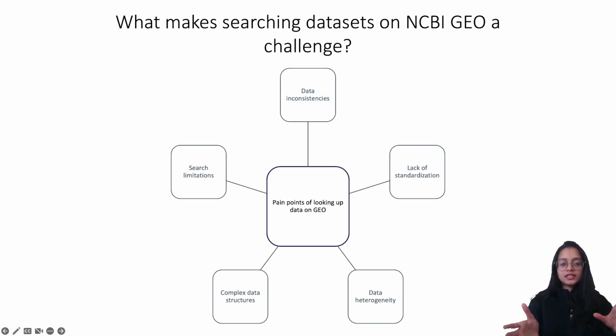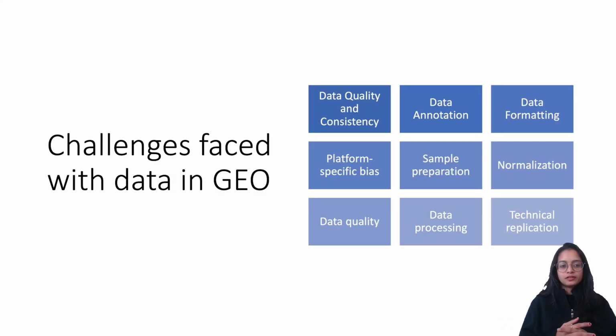In addition to these challenges of looking up datasets on NCBI GEO, there are also challenges associated with the data that are present in GEO. Even if we do manage to find the relevant datasets of our interest from GEO, there are still challenges that we face with the data that we download from GEO.